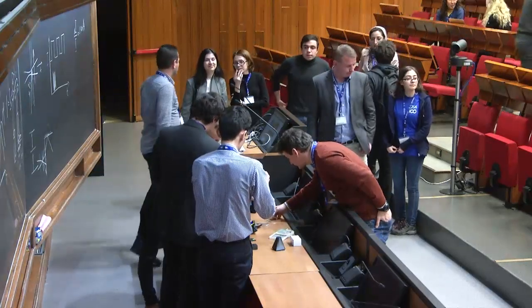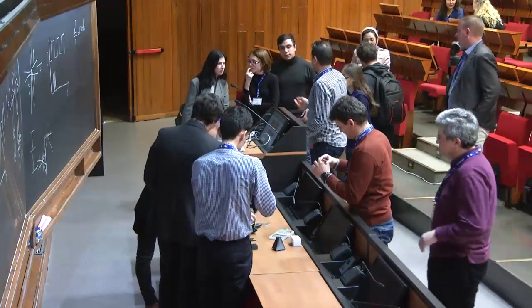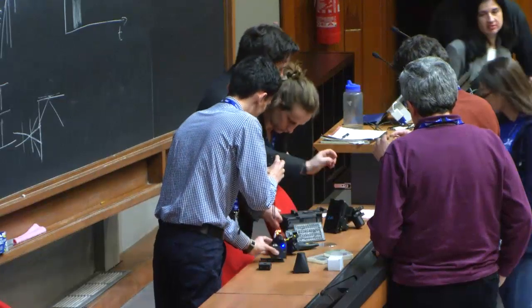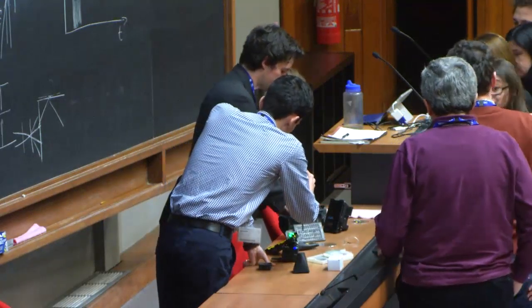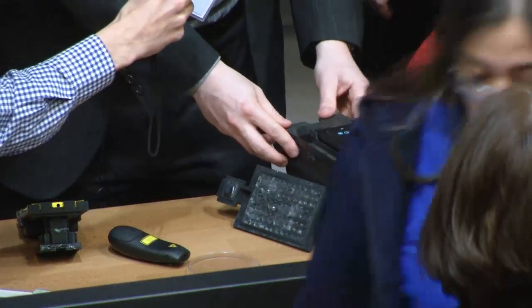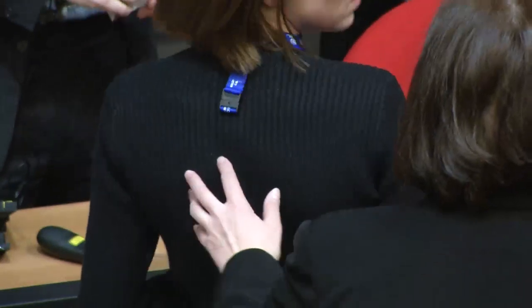So this is in here. And so when you load in the ELISA well plate, you put it in here. But, and let's grab this mobile phone. So this one needs to be plugged in. This can be battery powered, but we don't operate it as battery powered because the power of the LEDs is very important.